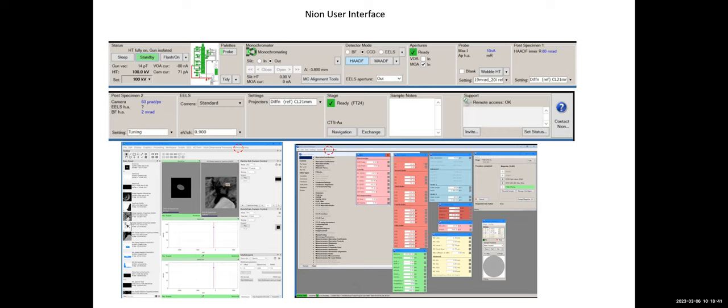There is one additional point I want to add. The main point of having an aperture, if we describe it using technical terms, is we are limiting the convergence angle of the beam. This angle actually is a very important technical parameter. That is why in most of the papers today, if they use STEM or STEM EELS, they always say we use a convergence beam with convergence half angle alpha equals 20 milliradians, 25 milliradians, 30 milliradians, or 33 milliradians. So those apertures are just one way to form such angles. So you need to know that they mainly want to reduce the angle, and then it has the effect you're saying, cutting off the unwanted electron beams.